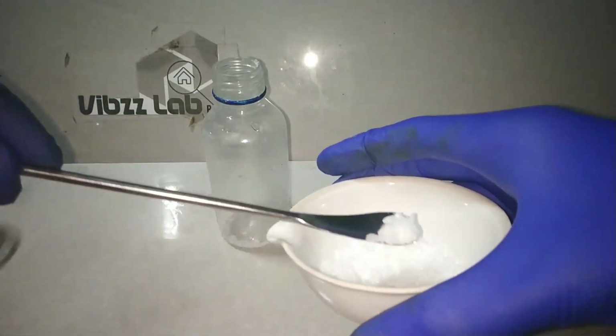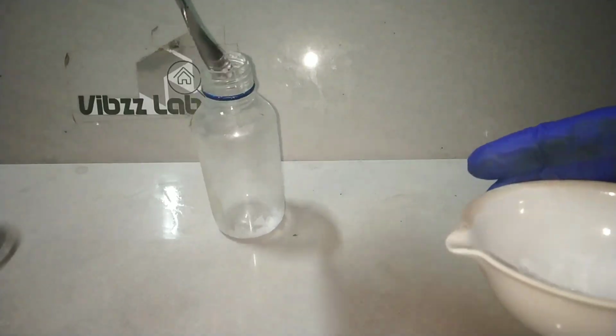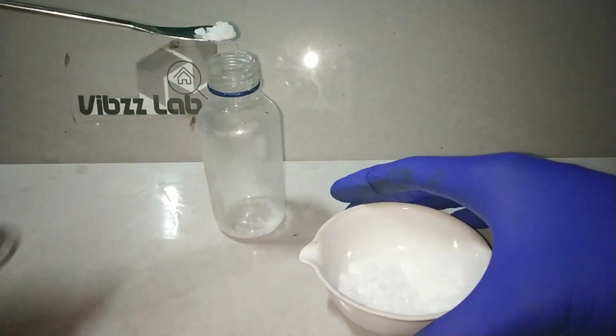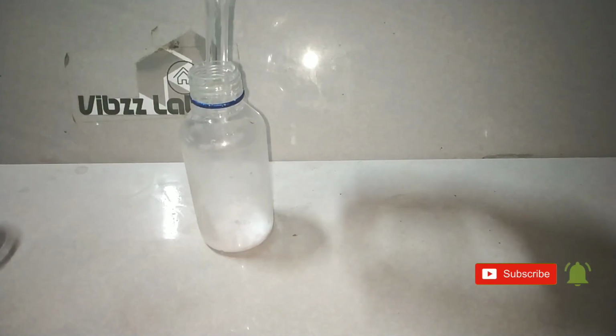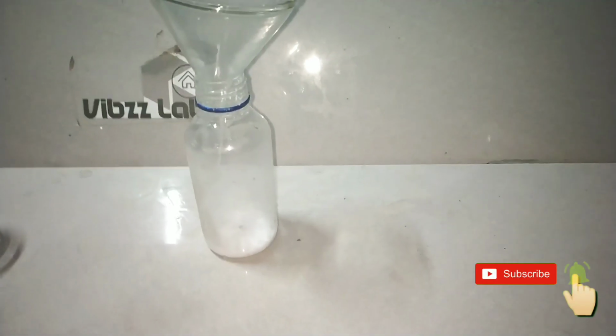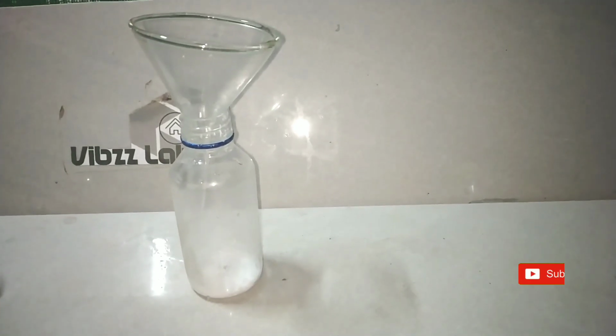I am using this bottle so that I can cap it firmly and make it airtight. I am doing this because I am unable to find the rubber cork for the Erlenmeyer flask that I have. An airtight reaction vessel will prevent any unwanted reaction that may occur with air, and it also prevents the loss of the isopropyl alcohol.